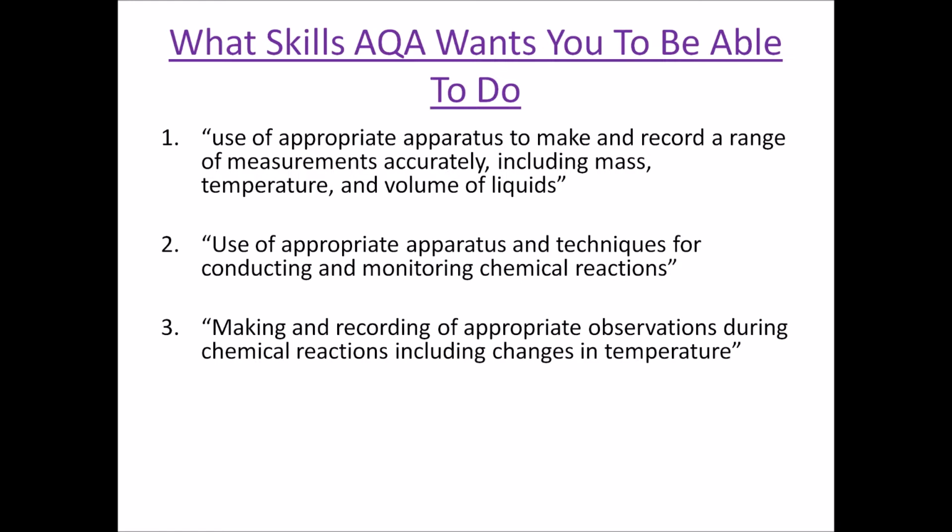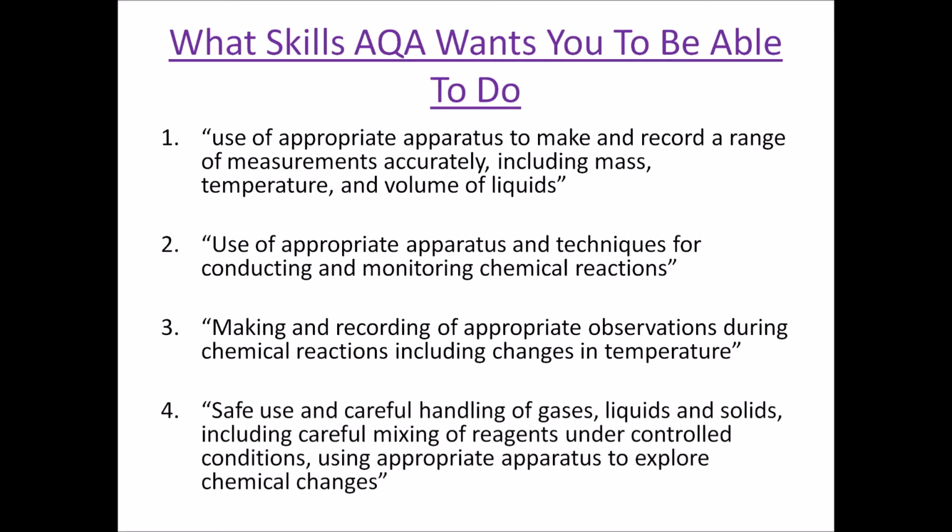They also need you to be able to record appropriate observations. In this particular case, again, it goes back to changes of temperature, so much the same as the first two. And they also want you to be safe in your use and handling of gases, liquids, solids, and mixing reagents under controlled conditions. So it's fairly standard stuff.